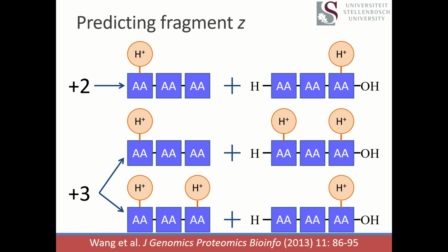Very good. So I used to do a talk about peptide fragmentation, and I had a slide up there called the divorce. For anyone who's ever been a close witness to divorce, you know that there's always a battle about the stuff. And in the same way, when a peptide bond breaks, there's this brief moment where these two fragment ions are going at it, hammer and tongs, deciding which one is going to abscond with the charge.